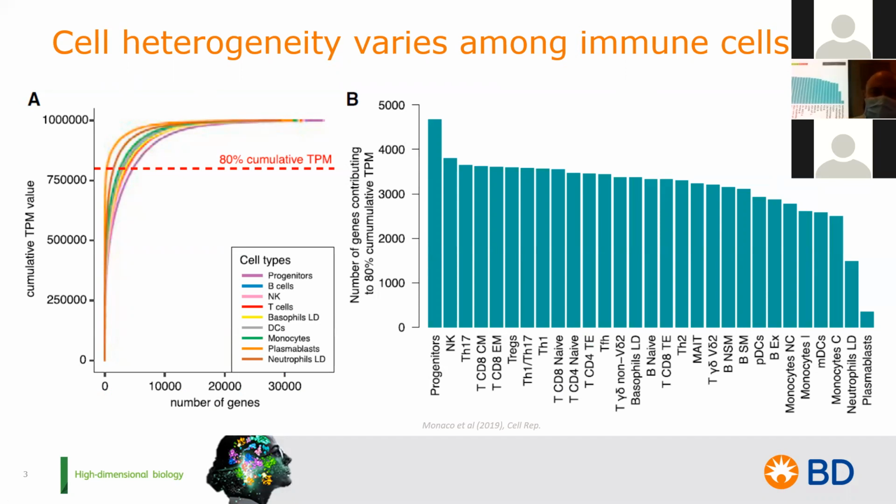And you can see on the right panel figure, we have all the different subsets, and we're seeing the contributions individually from each of these subsets to the total heterogeneity of your samples, which is why it's so difficult to get truly meaningful results despite having lots of publications making certain assertions.